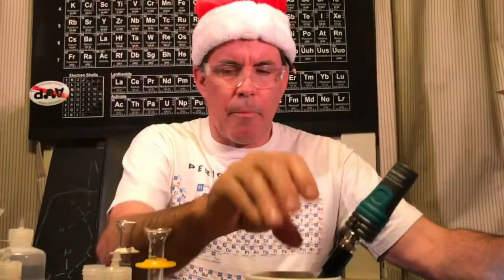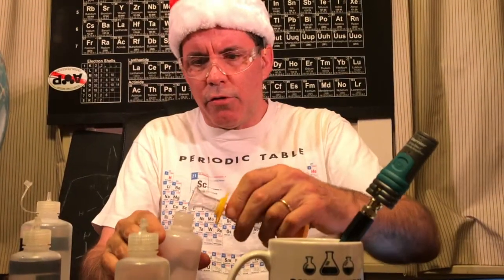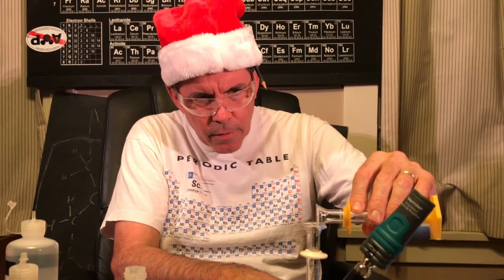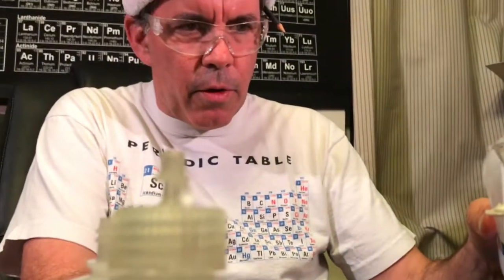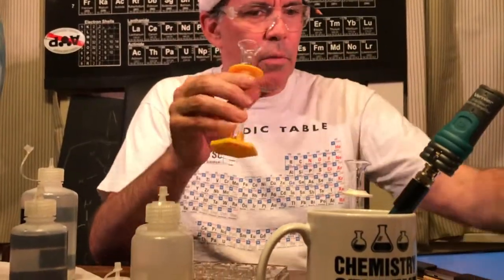Okay, the last thing I'm going to do is take 1 milliliter of this solution that I just made. I want 1 milliliter of it, and I'm going to add to it 4 milliliters of water. So let's see if I can do it in here. 1 milliliter of that mixture. And then I'm going to add 4 milliliters. So M1 is going to be the concentration that you came up with for M2. Okay. Pour that out. This will be our final mixture.